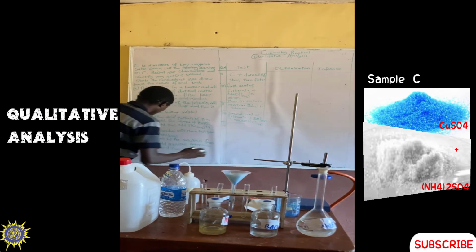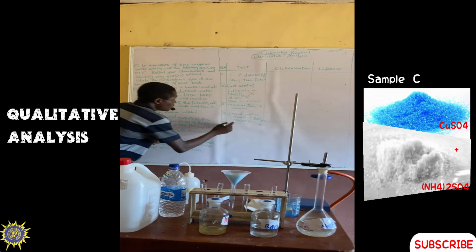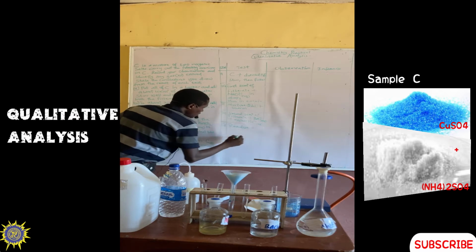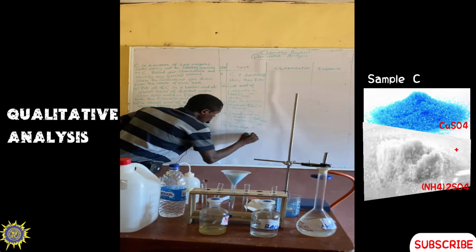So remember, put all the residue, that is the residue of the C, the residue obtained from the mixture of C now. We have residue plus HNO3. So what do we have?